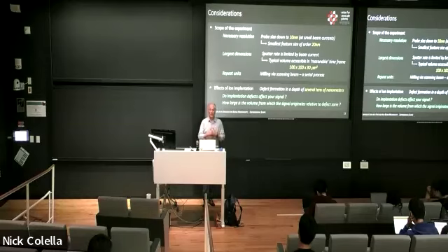So if you want to do electric measurements, you need to consider, is that changing the electric conductivity? Is it changing my optical properties? So there are a lot of considerations. These are fundamental considerations that you have to make. And so we had applications that we had to stop, right?